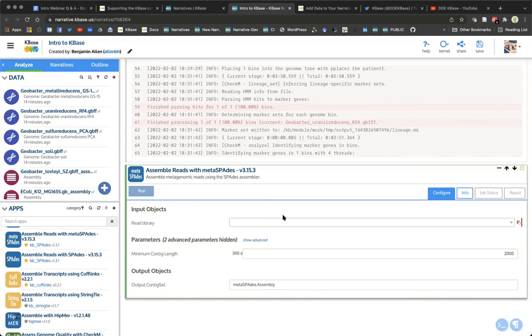In fact, I can run several jobs, I can close out my browser, I can walk away from my computer, and they're all going to be running there in the background. So we'll often see people do this on the system, where they'll run several large jobs and come back a few days later, and then we see them doing other processing on it.